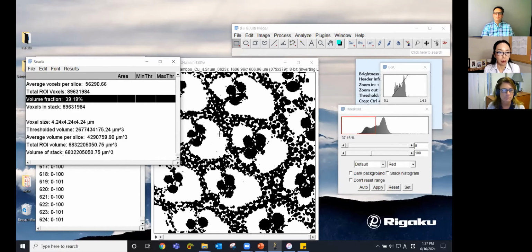Let's see, are there new questions, Tom? We have had a couple of questions come in. Okay. First one is, is it possible to remove what it describes as noise dots? I think it just means noise, right? From an image in both the view and in the statistical calculation. So it's kind of a, can you erase almost like a bad pixel?